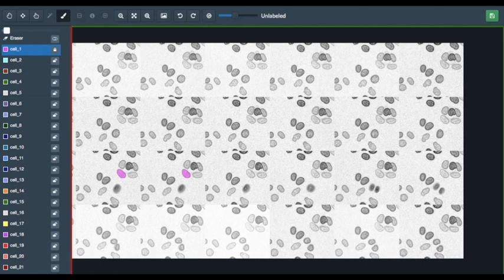One way that cells can appear or disappear is through cell division. Cell division looks like this. A cell will become slightly peanut-shaped and then will split into two separate cells. When the cell divides, the two daughter cells should be labeled using new colors, and the color of the parent cell should not be used again.